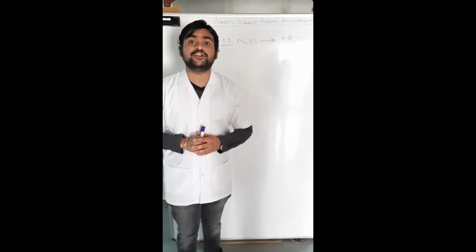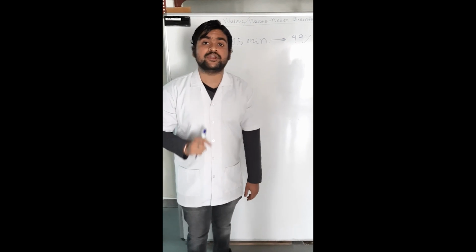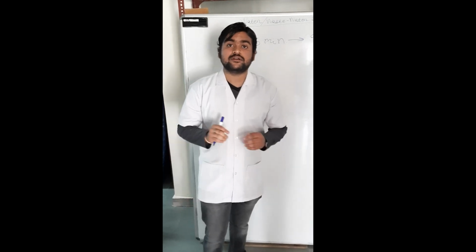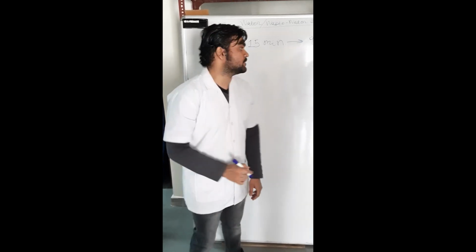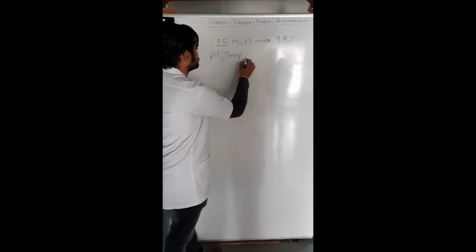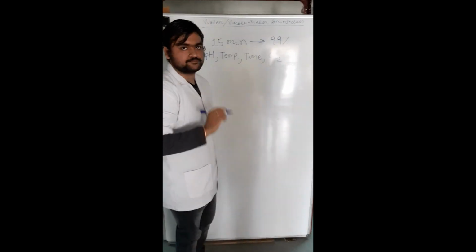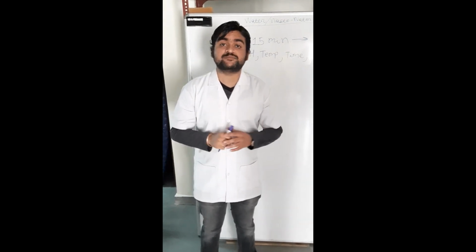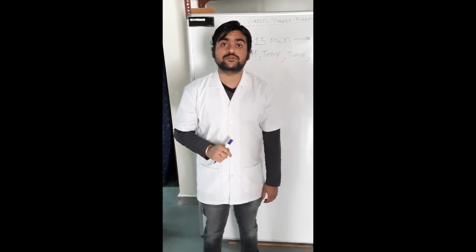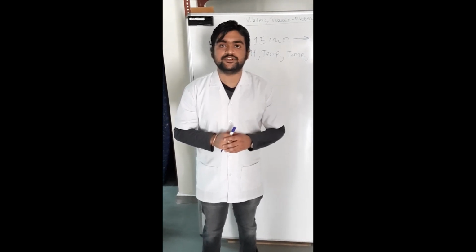What do you mean by chlorine demand? It is defined as the difference between the amount of chlorine applied and the residual chlorine at the end of the contact time. And this chlorine demand also varies with pH, temperature, contact time and amount of chlorine applied. The sole objective of this experiment is to estimate the chlorine demand and breakpoint chlorine dose for water and wastewater and to remove the COD by chlorination, etc.